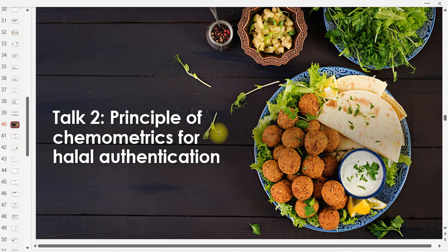So chemometrics is just a jargon that plays around. Actually, chemometrics is chemicals being used as variables in different matrices, and in general we call it multivariate data analysis.